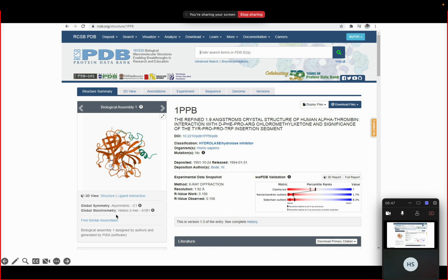Yeah, I guess we can start. So what we're gonna do today is a little hands-on: how we can take a structure from the PDB, and then visualize it and understand certain structural aspects of it. Okay, so we're gonna do that. For that, firstly, let me exit the screen.